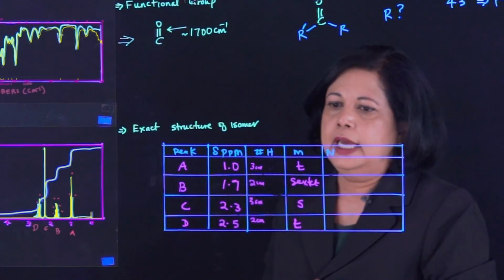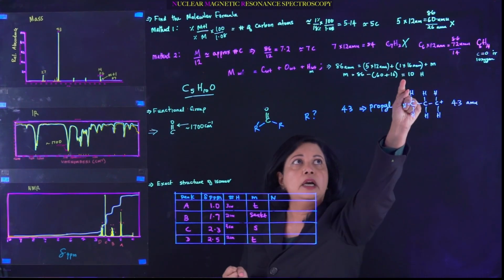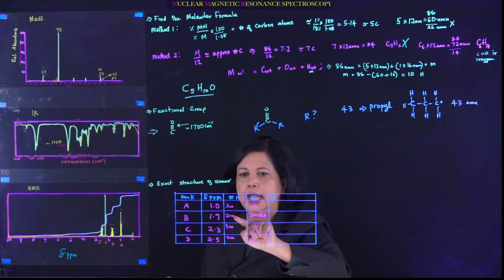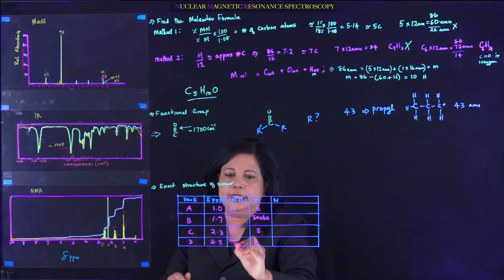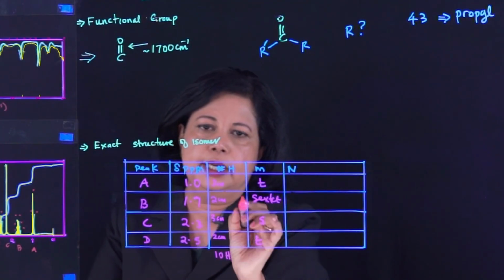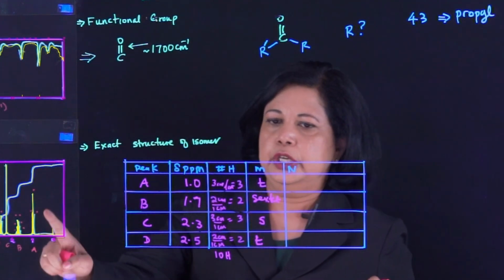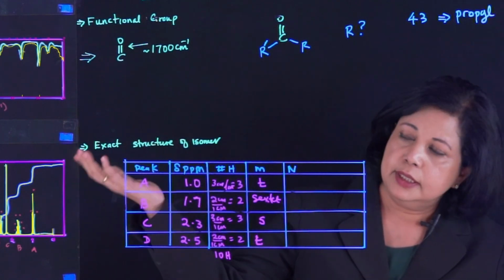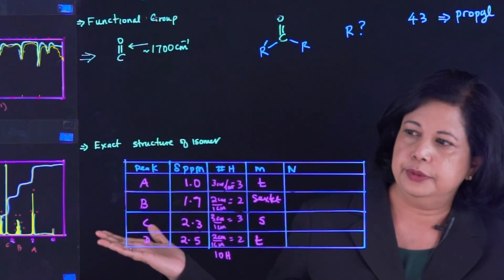Do we even have to divide the numbers here by the lowest denominator? Look how many hydrogens we have. We have 10 hydrogens, adding up 3 plus 2, 3 plus 2, a total of 10 hydrogens if you divide everything by 1 centimeter. So we have a ratio 3 to 2 to 3 to 2. 3 would be maybe a CH3, CH2, CH3, CH2.